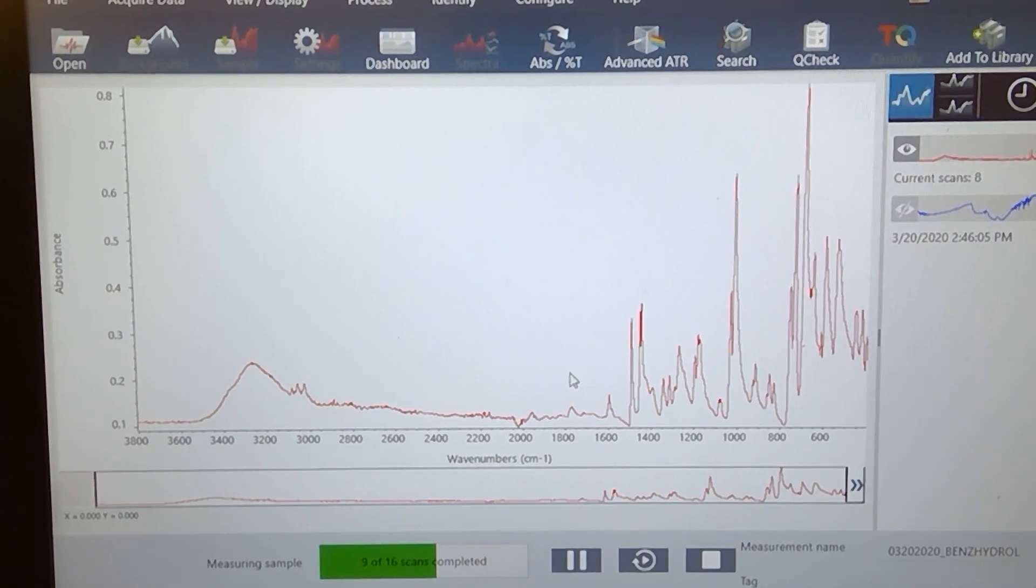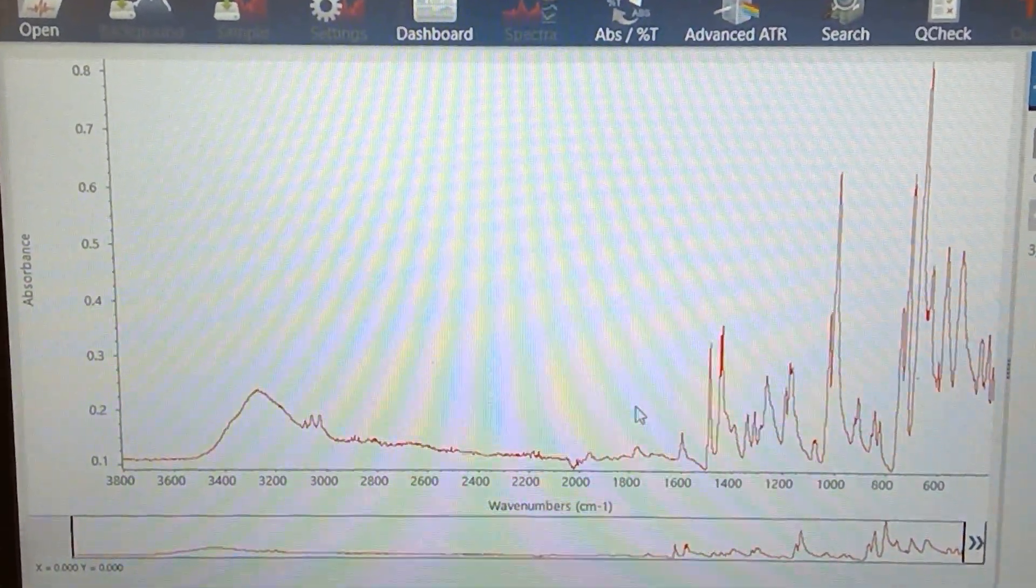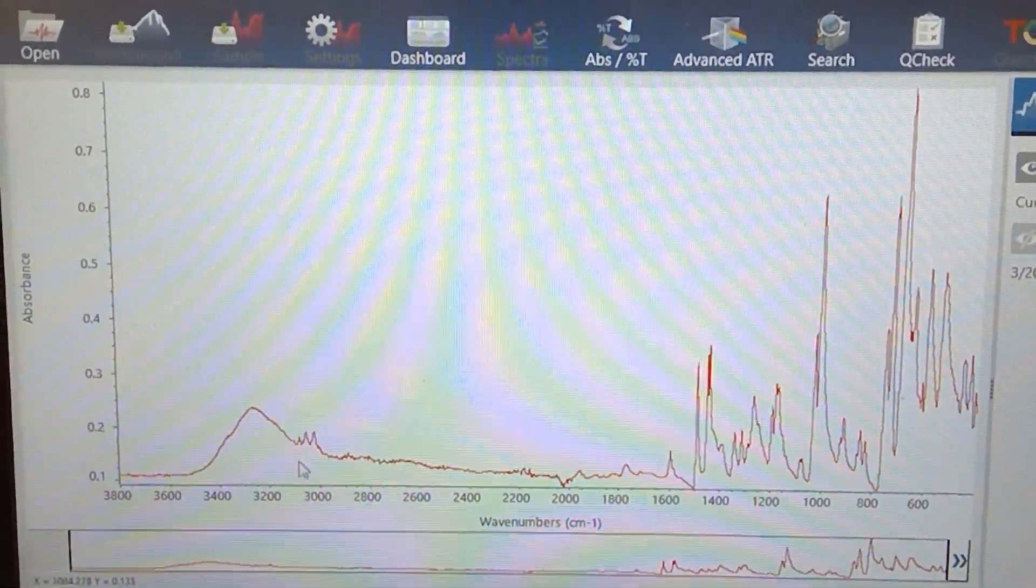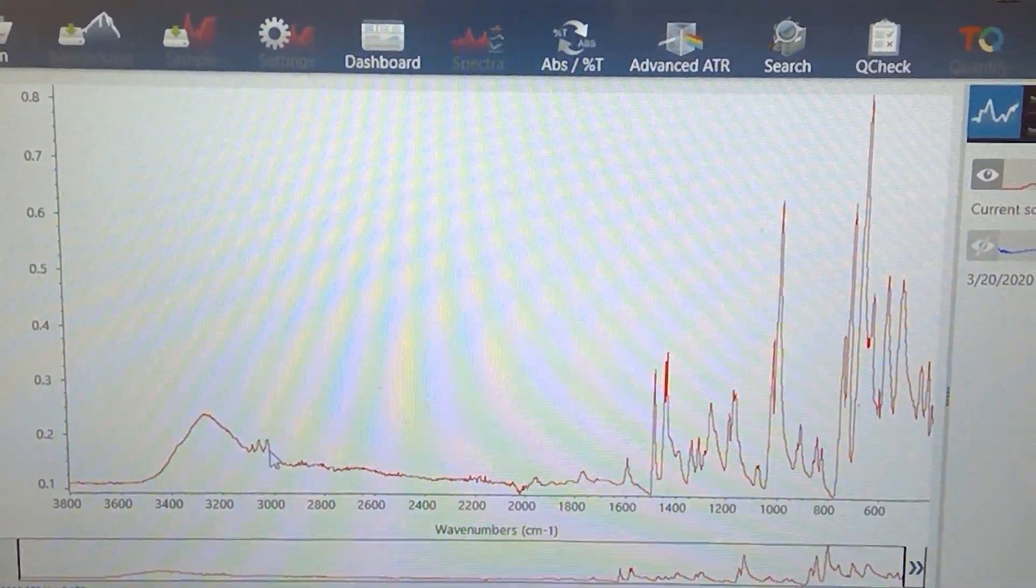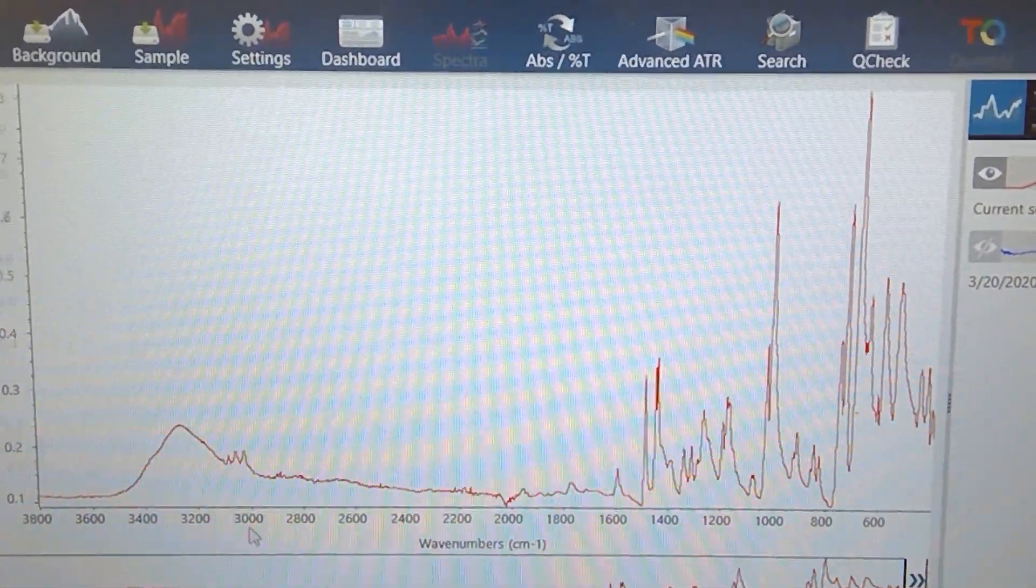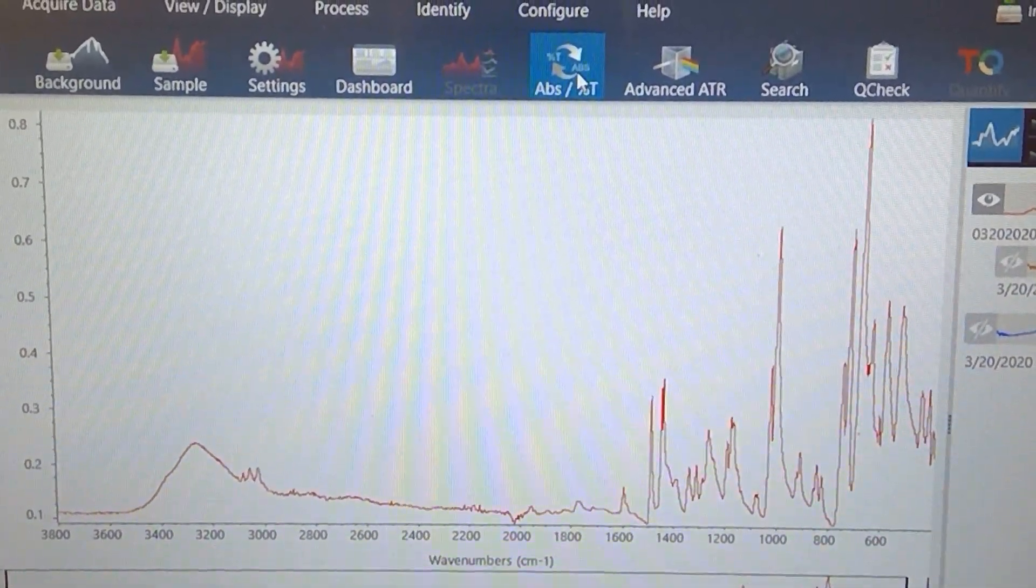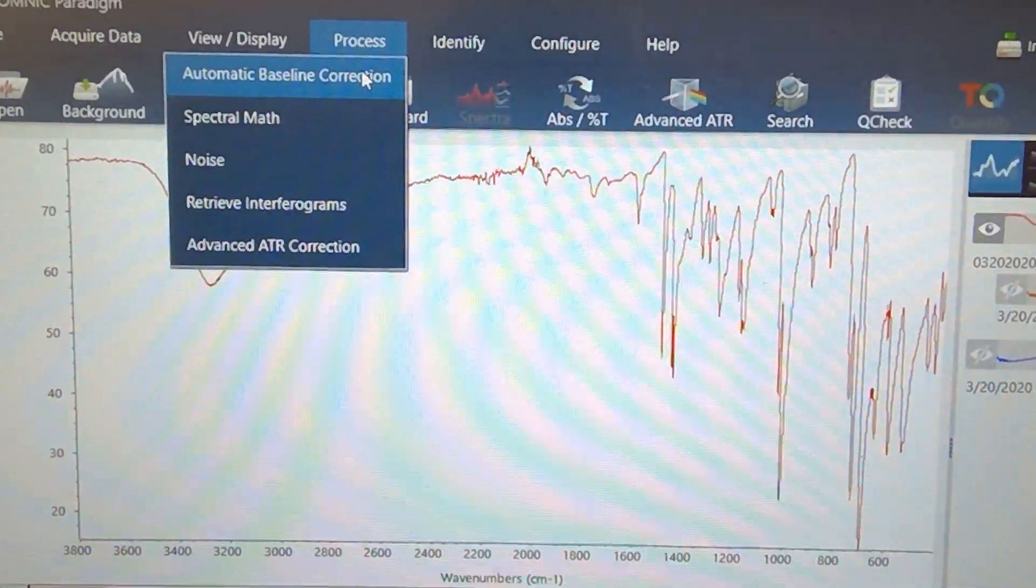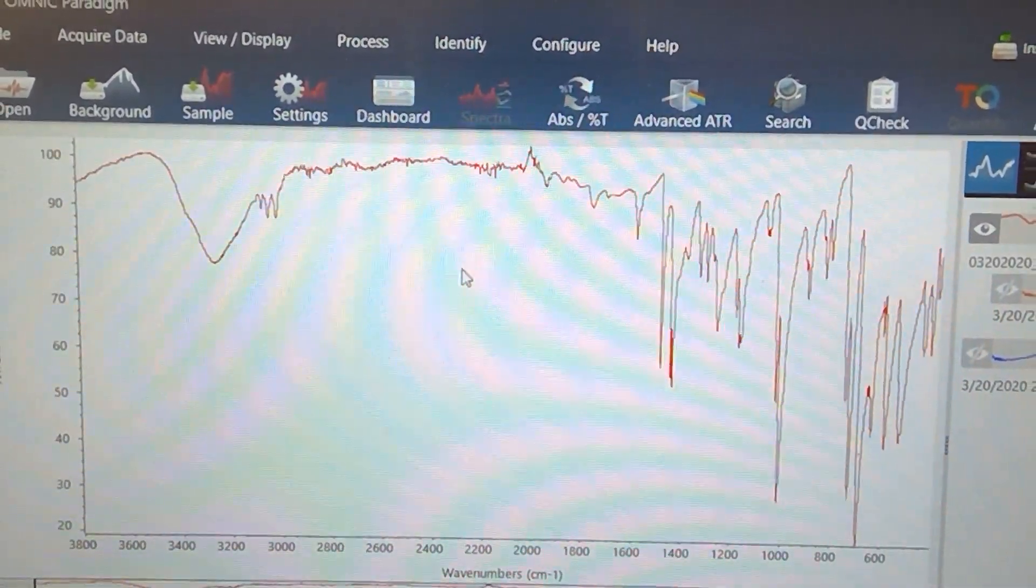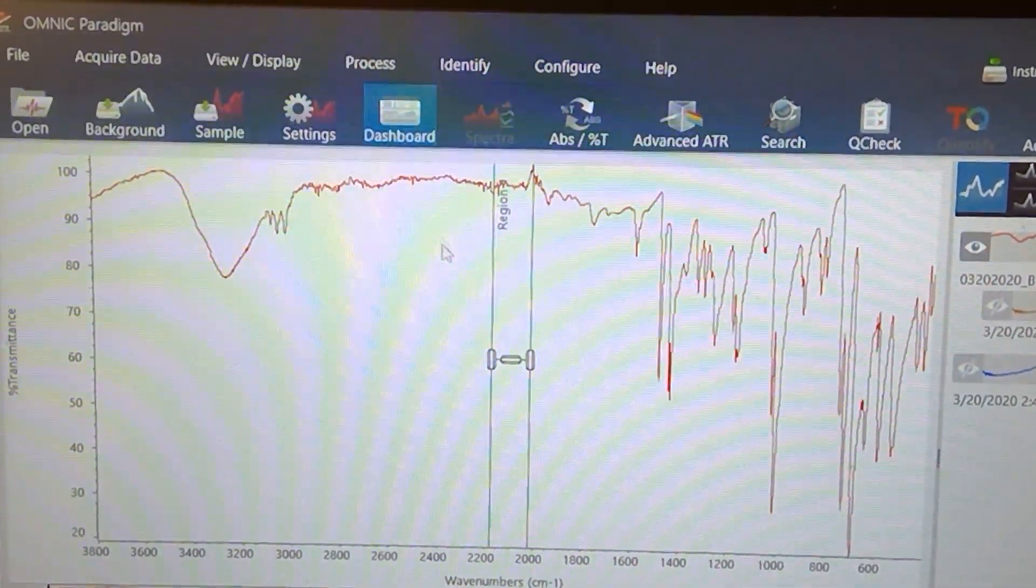Nice, we see an alcohol peak starting to grow pretty significant, so that would be right here in this area. This looks like hydrogens that would be connecting to a benzene ring. Let's go ahead and flip this to the right direction, wonderful, and I'm going to ask it to correct my baseline.